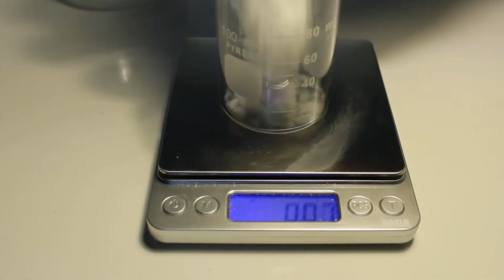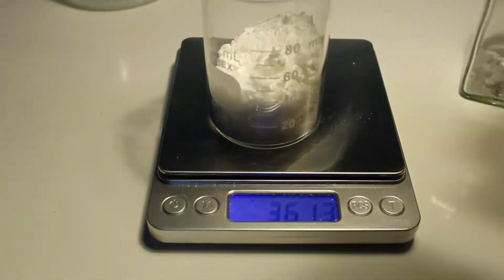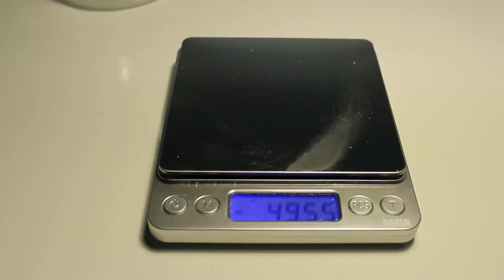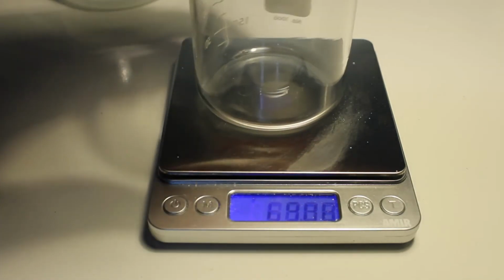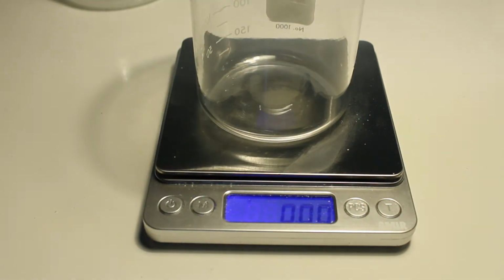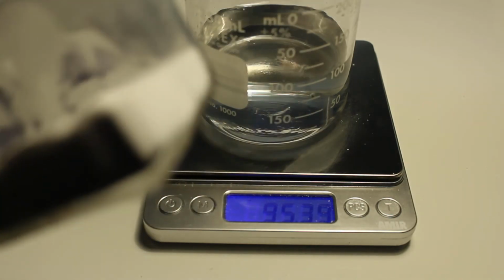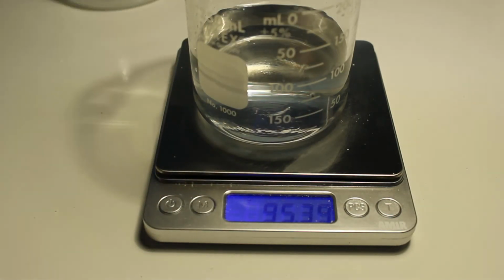Beginning with the sodium citrate. Next part is to add the sodium carbonate and the water. So, new beaker. And so, for water, you're going to need 100 milliliters. So, in a surprising turn of events, I do not have enough sodium carbonate. So, now I'll show you an easy way to make some.